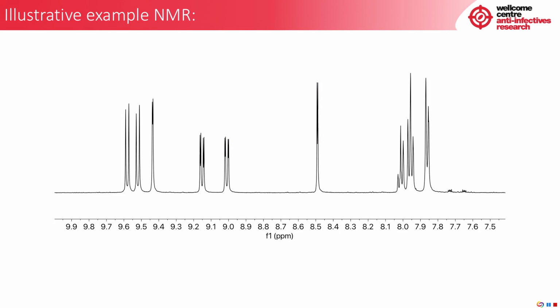I'm also not going to talk about why these aromatic protons are at nearly 10 ppm, but maybe we'll come back to that in a later talk. So the format's going to be a quick summary of how NMR works, some discussions of the origins of splitting, and then finally what influences the observed J values.